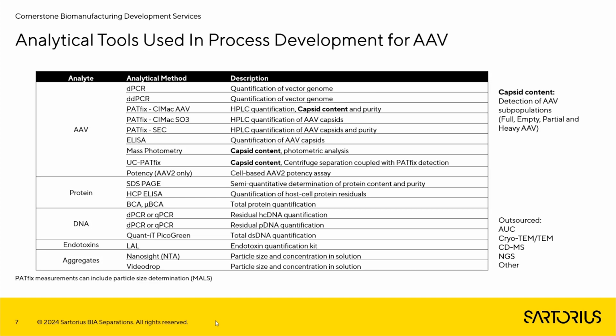The core of the analytical strategy is focused on leveraging PatFix analytics, complemented by a range of orthogonal techniques, including PCR, mass photometry, ELISA, and others. The orthogonal approach really ensures process understanding and provides confidence in the developed procedures.